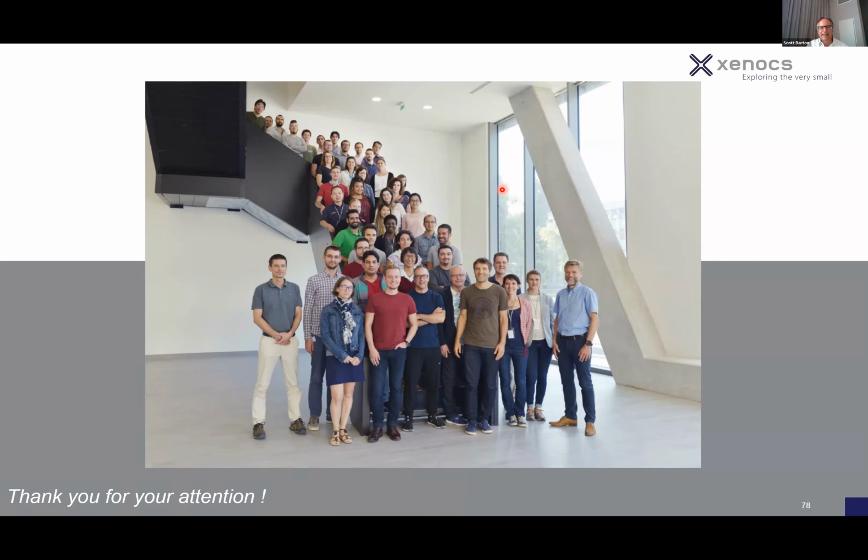I will say that we don't have the GI-SAXS stage, unfortunately. Oh, for your building system here? On the SAXS, we do have the software. If we had the data, we could model it, but we don't have the stage to be able to collect it on our small angle system.